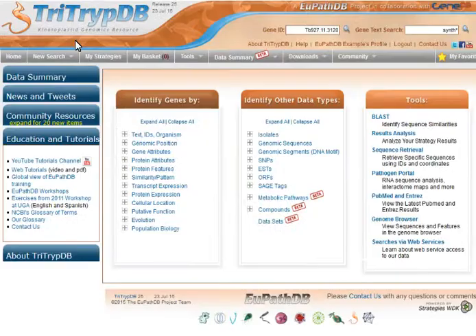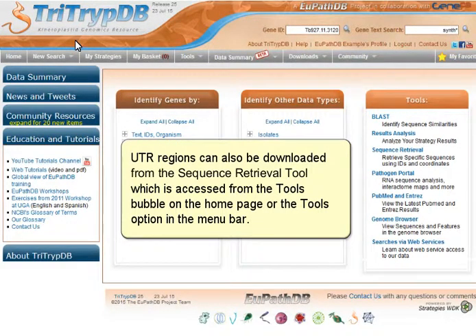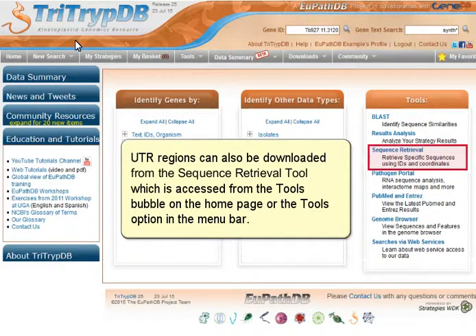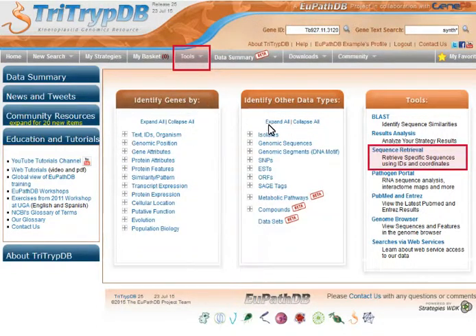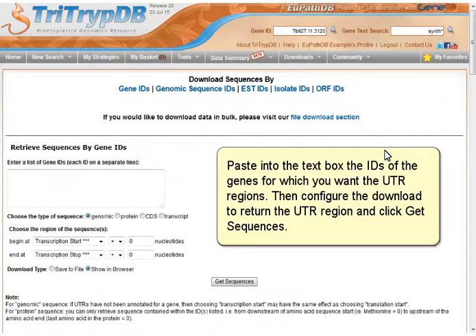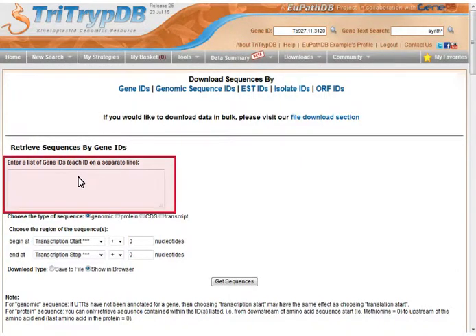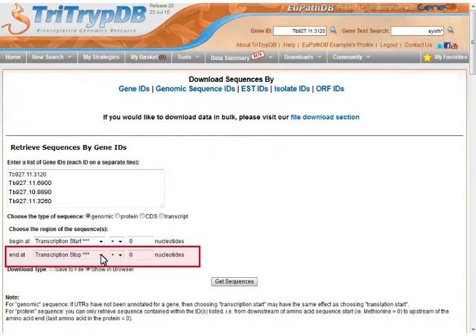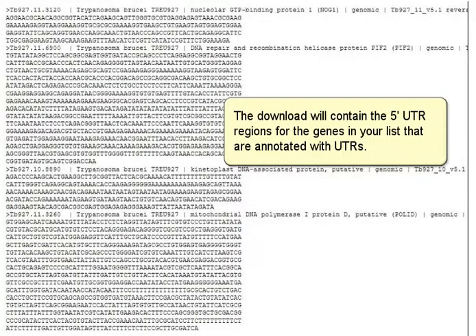Let's go back to the home page. UTR regions can also be downloaded from the sequence retrieval tool, which is accessed from the tools bubble on the home page or the tools option in the menu bar. Paste into the text box the IDs of the genes for which you want the UTR regions. Then configure the download to return the UTR region and click Get sequences. The download will contain 5' UTR regions for the genes in your list that are annotated with UTRs.